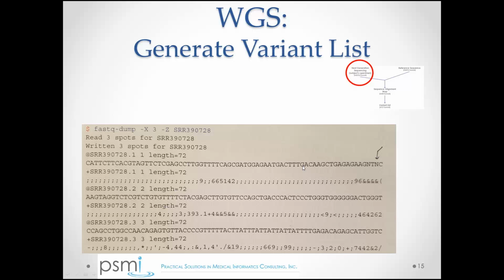So what these quality scores represent is the per base quality score for a particular read. Again, each one of these ASCII characters corresponds to a different quality score. Usually the bar is set at least at 1 in 100, or 1 in 1,000, or 99% accuracy at this stage, or depending on the scenario, 99.9% accuracy is required at the read stage in order to have any confidence in this base, in order to use it for further processing downstream.